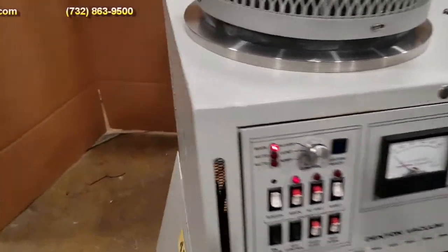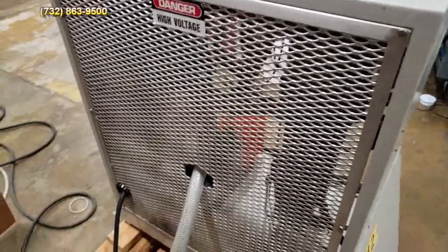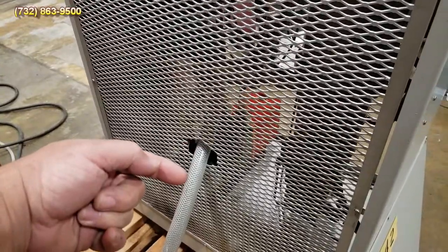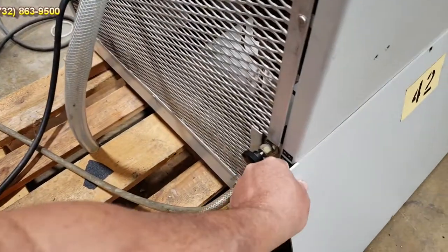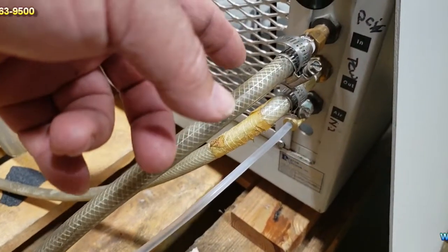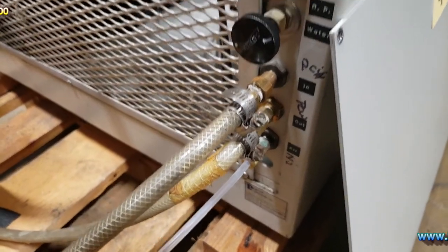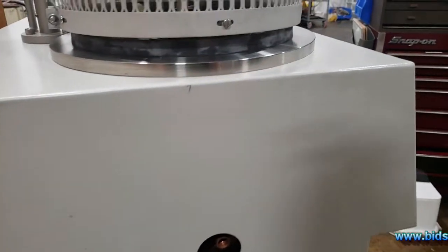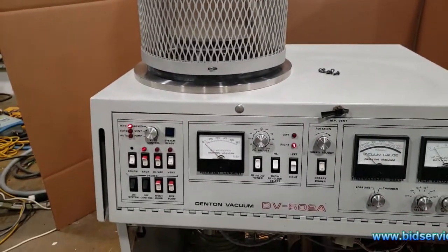So let's go to the back of the system. Back here, I just want to show you - you have your power cord right here, and you have your exhaust for your pump. Over here, next to the front panel, you have your water hookups and your control for your diffusion pump. This system also requires you to have pneumatic - you need 80 pounds of compressed air to run the valves.